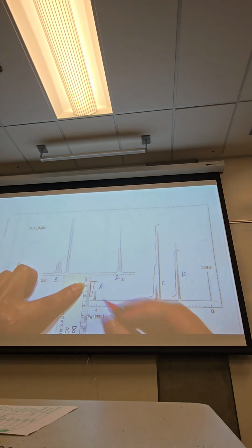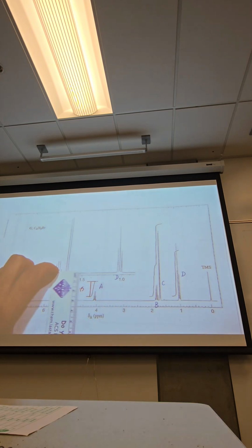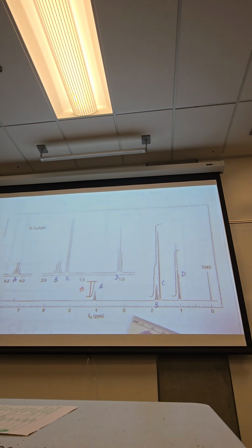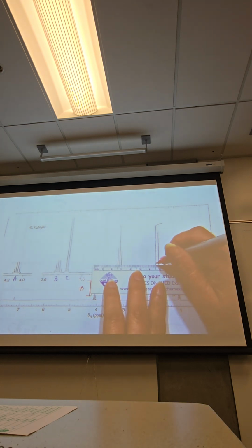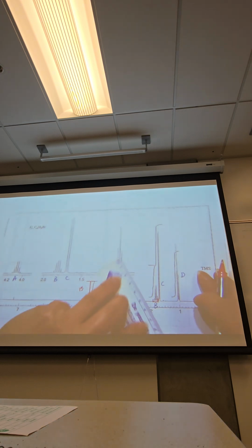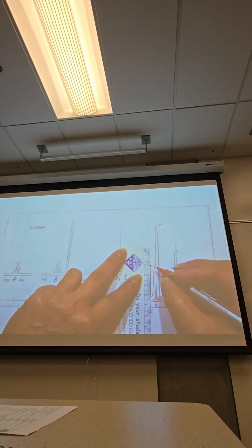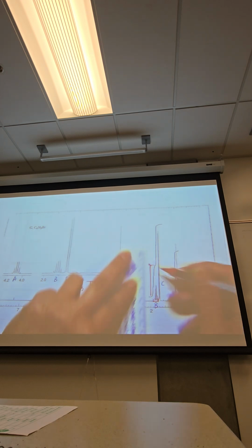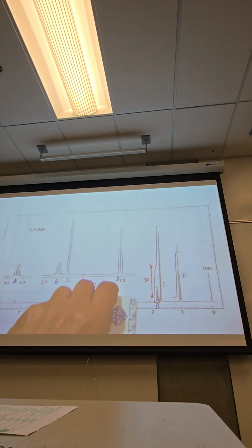I have 15 millimeters or 1.5 centimeters, fine. But the critical part, which confuses a lot of people, is that signal B is only being covered through there. So this distance is signal B: 1, 2, 3, so about 30 millimeters or 3 centimeters.